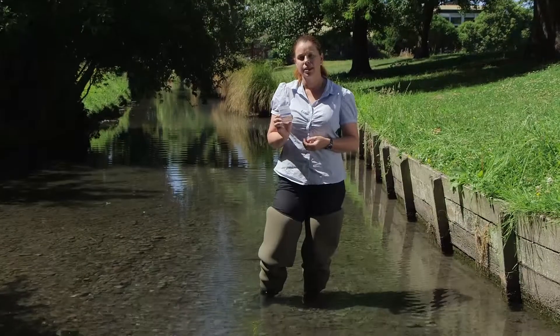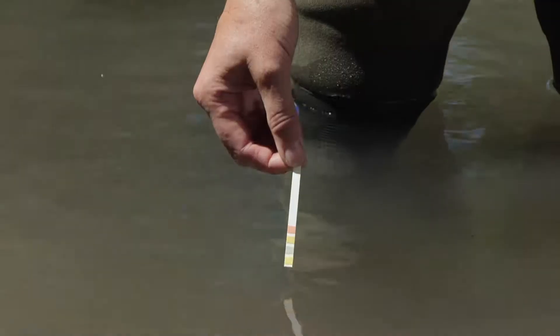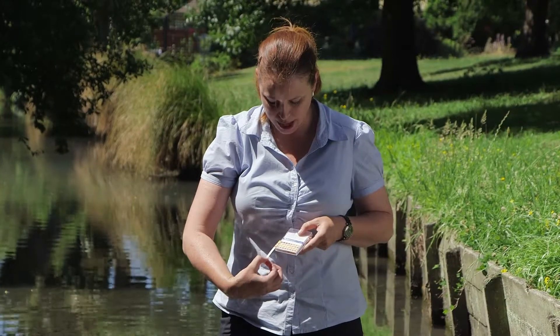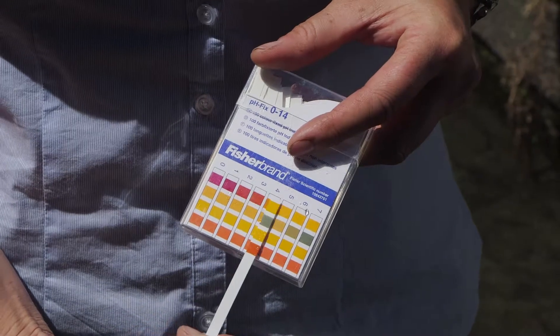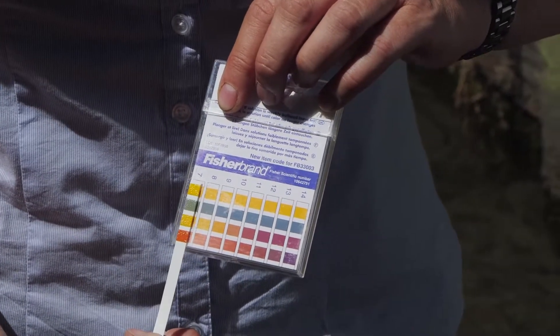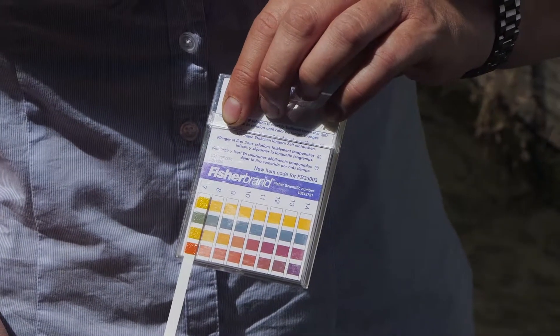pH strips are another option to quickly check your pH and are easily available. Take a strip out of your container and put it in the water so that the four bands are covered and get nice and wet. Then bring the strip up and check it against the four color bands on your pH container until you get a match. You can see here that we're sitting between probably the seven and the eight.